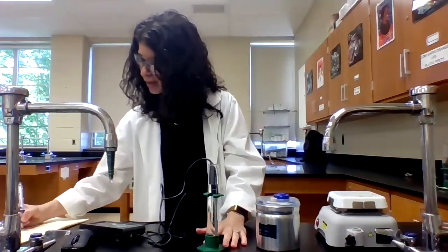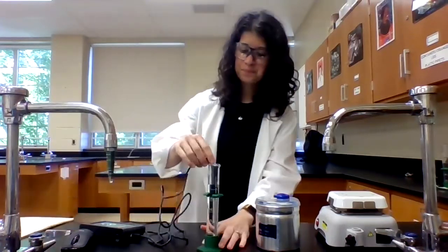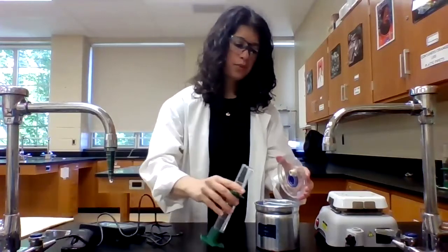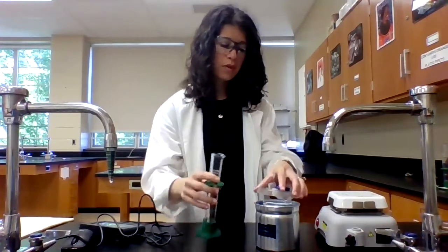And so that's reading at 22.0 degrees Celsius. Pour that in here. I also need to measure the temperature of the hot water, and then immediately get that into my calorimeter. And I am going to stir this.